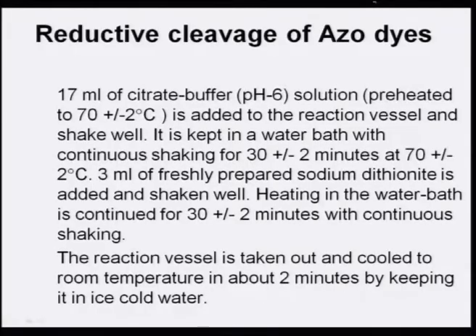What I am trying to draw your attention to is that these protocols have to be strictly followed. The chemical analysis cannot be done at one's whims and fancy. One has to follow the procedure, and for every banned chemical there is a testing protocol prescribed by the government or the ordinance. Reductive cleavage of azo dyes.